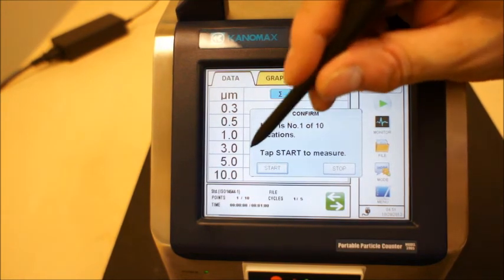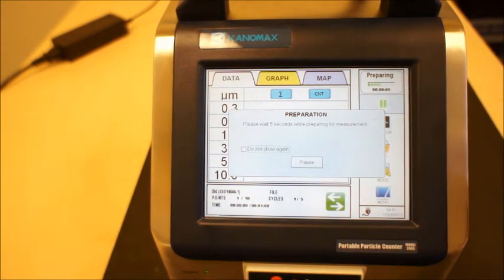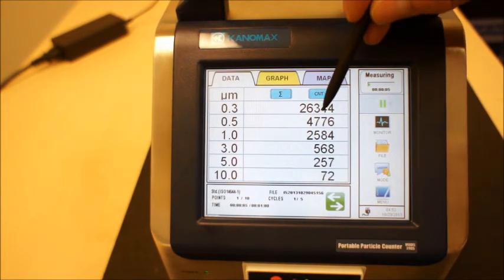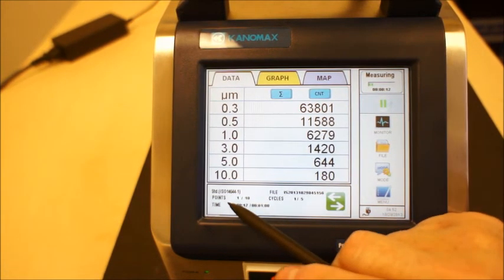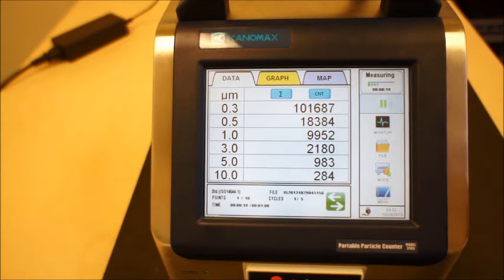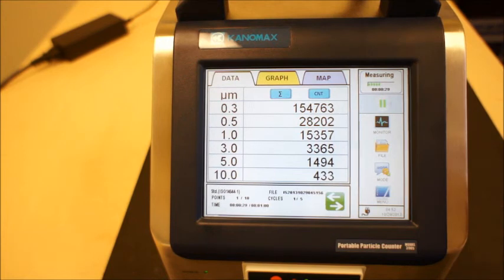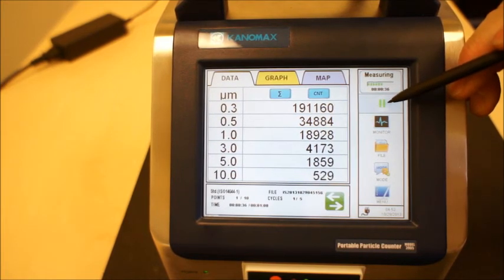We're starting now at number 1 of 10. It pauses for 10 seconds allowing you to step away from the instrument while it's being operated. You can see the counts as it's going through its measurement cycle. It notes the standard that you're in, what point it's in, and the duration of each cycle. We'll take that through the individual cycle. Here's the measurement time — it'll tell you the amount of time left in that cycle — and if you want to pause the instrument you have the ability to do that at this point.